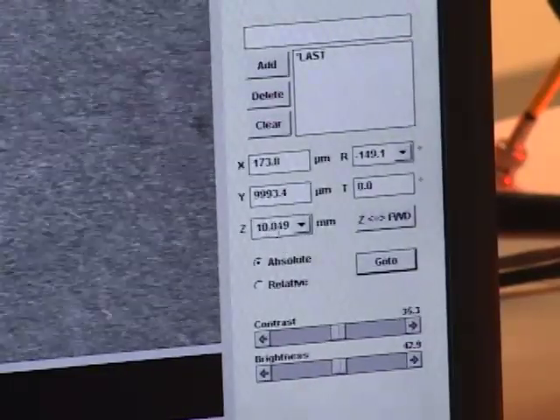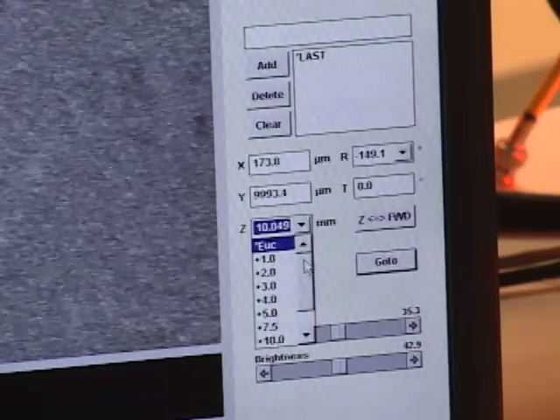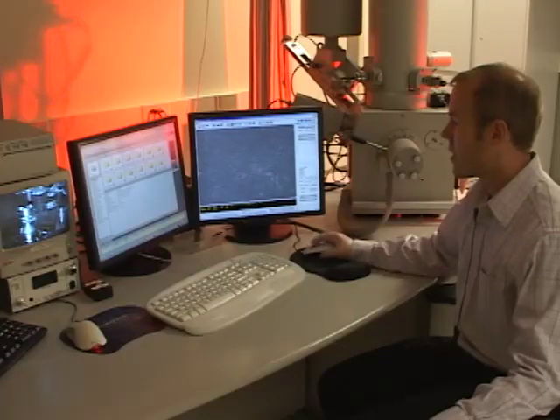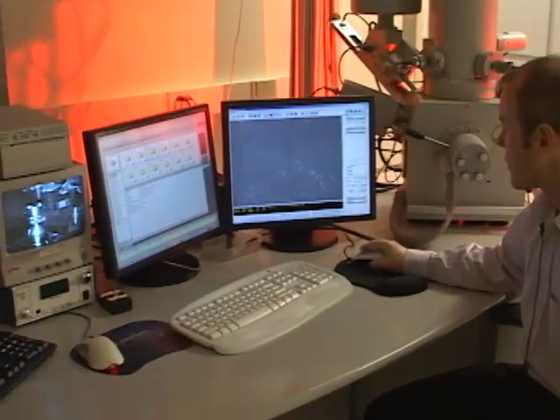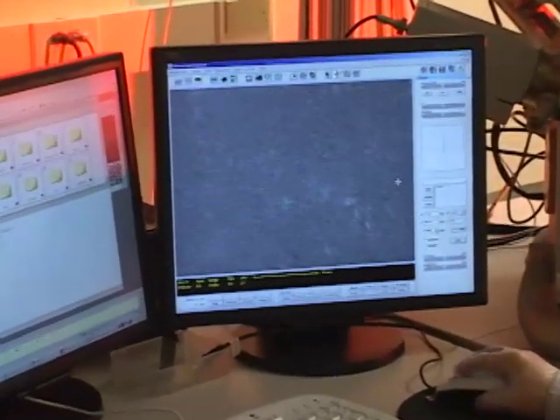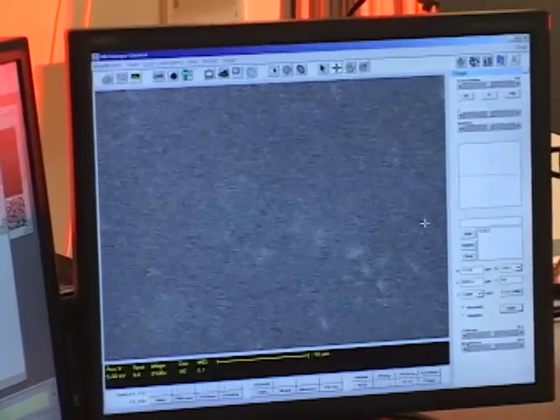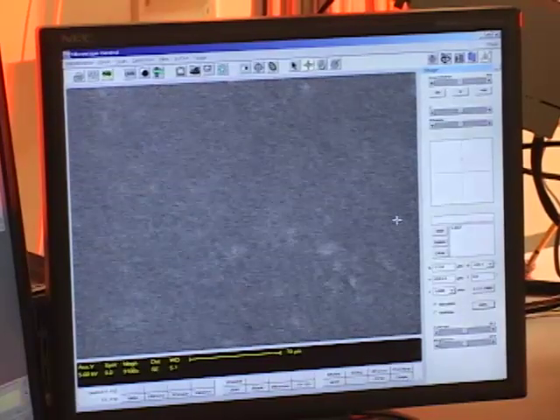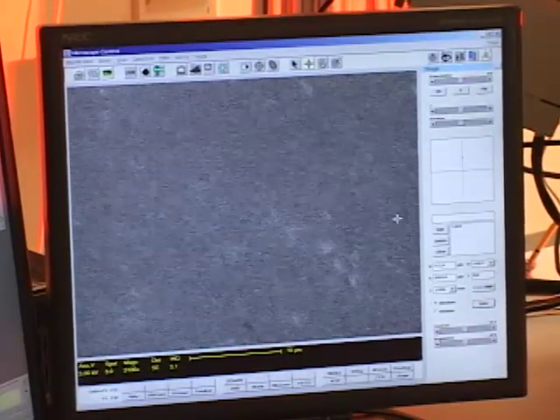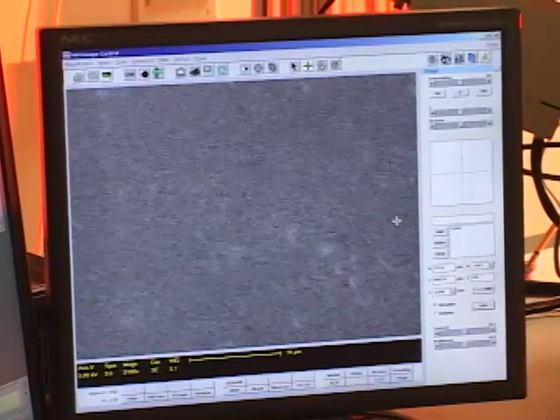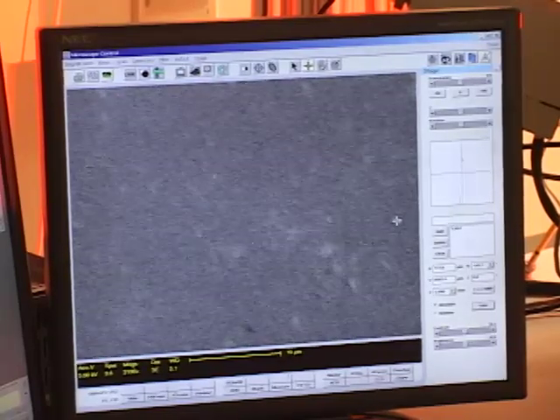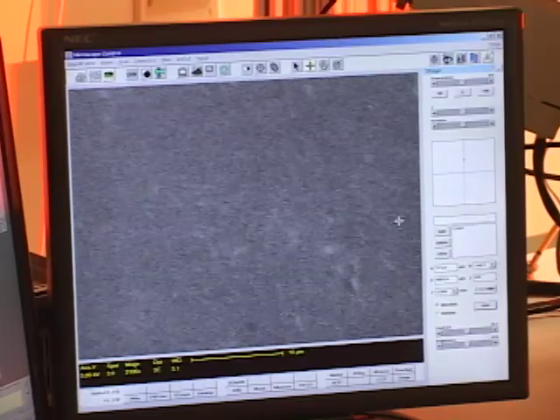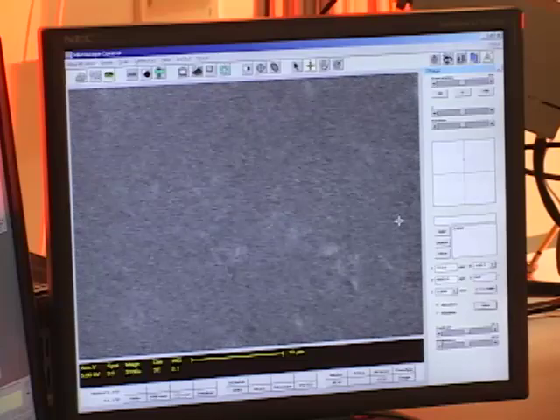So I'm at 10.049. I'm going to drop this stage clearance now down to five. And I will initiate that movement. And I'm ready to cancel in case the cancel box opens. We're at the final working distance. So again, I'll focus. And I can't see very clearly because the beam conditions haven't been optimized yet. Even though the sample's in focus, if the beam isn't perfectly round, we'll get a distorted image. And that hurts our resolution quite a bit. But when the beam is optimized, we should be able to resolve down to about 10 nanometer size structures on the surface of the sample.